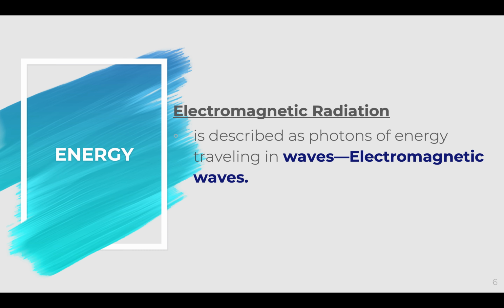It is very important for us to understand electromagnetic radiation and eventually your electromagnetic waves because, similarly to what we were discussing in your Beer's law, we will be introducing your light, or your light energy. Technically, that is your photons. So technically, we will be measuring the light that is being transmitted from your solution to indirectly measure your absorbance. So when we are talking about your electromagnetic radiation, we are talking about your electromagnetic waves.